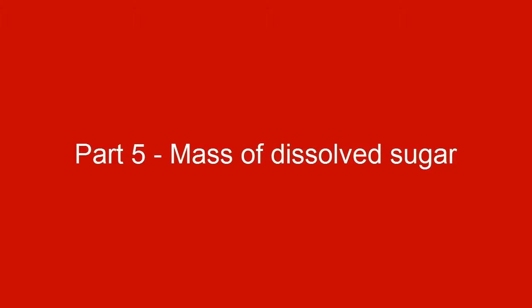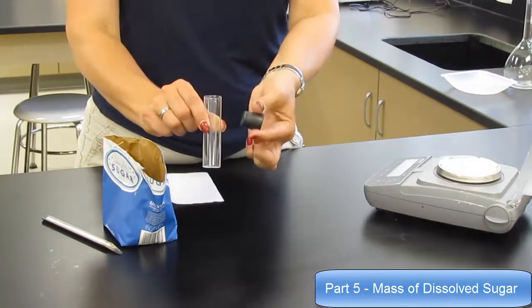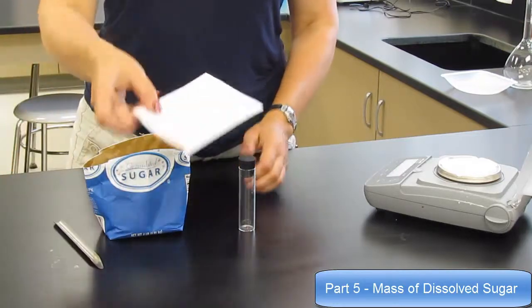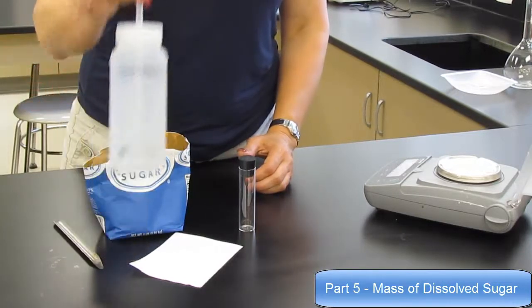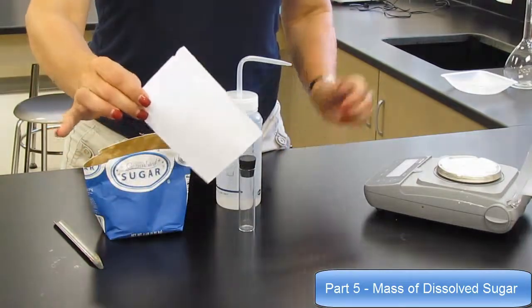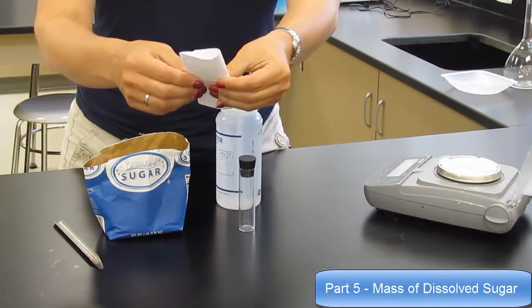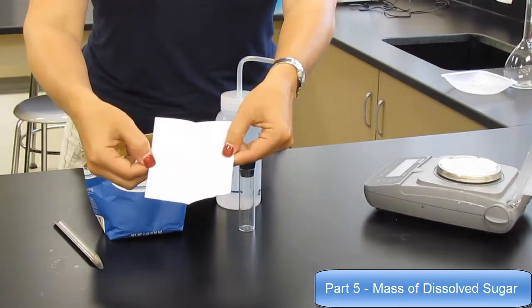Part 5, mass of dissolved sugar. For this one, you're going to need a vial that has a stopper end. You're going to need some sugar, a spatula, and then finally some paper to make a tare paper for your balance. You're also going to need some water, distilled preferably. Take your paper and fold it twice. Fold it lengthwise, unfold it, and then fold it the other direction. What this does is make a little pocket for you to put some material in.